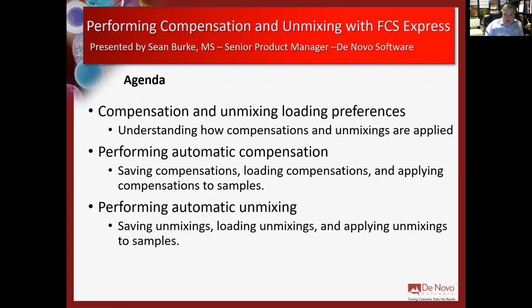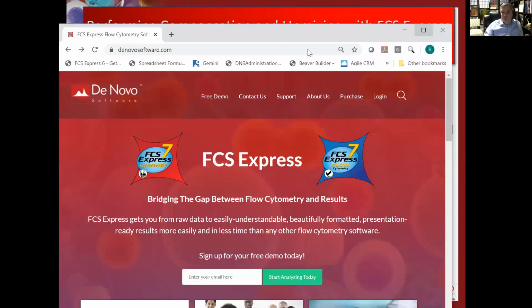So I know unmixing in FCS Express is new to a lot of people. I want you to keep in mind we're going to cover that at a high level today and talk about the practicalities of implementing unmixing in FCS Express.